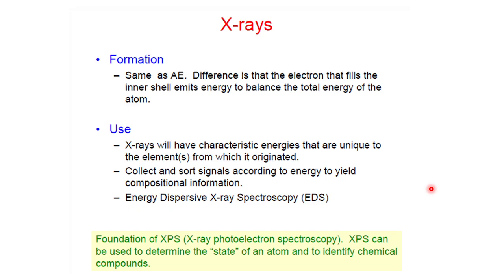This is the same. That's why if the surplus energy is compensated through the X-ray, it is called EDS, energy dispersive X-ray spectroscopy, and we know that through EDAX we check, along with FESEM. With FESEM there is another component, EDAX, so that we can characterize the different composition of a sample, because it is the inherent property of your element, so of course there will be variation.